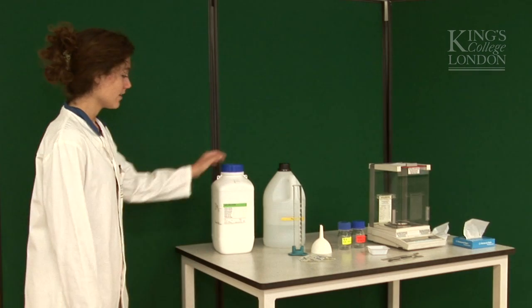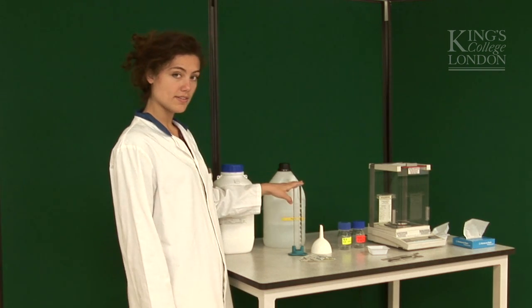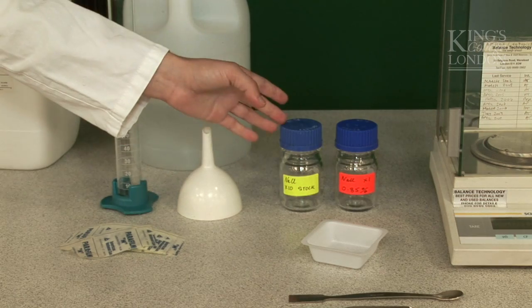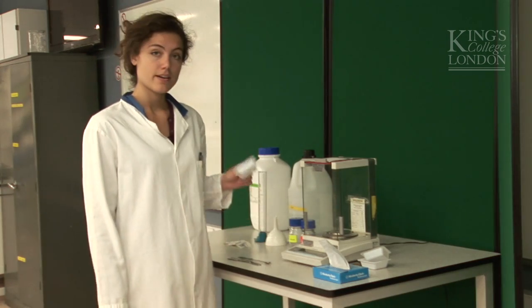What do we need this time? Sodium chloride comes as a powder, distilled water, a measuring cylinder, some parafilm, a funnel and two bottles for our solution, and of course a balance, a spatula and a weighing boat.